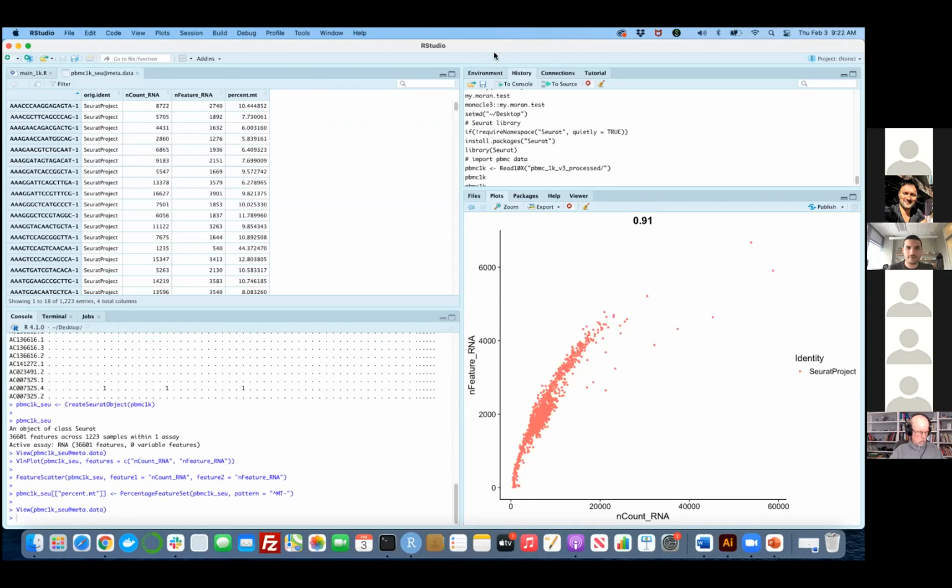Sometimes checking if I'm getting any questions. So as you can see now, originally we have the total UMI count and the number of non-zero genes, but now we have the MT percentages as well. So basically what we are trying to understand is whether some cells, even though they have a substantial amount of UMIs and some number of genes, have an extremely high mitochondrial RNA percentage, which may indicate that some of those cells are in an apoptotic state.